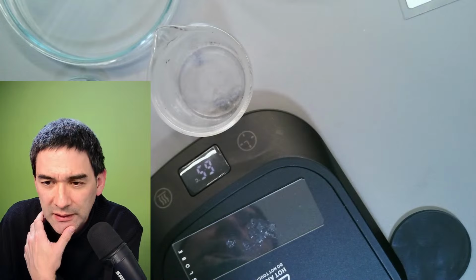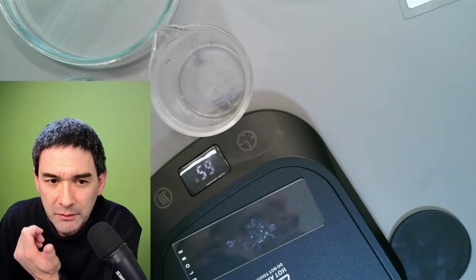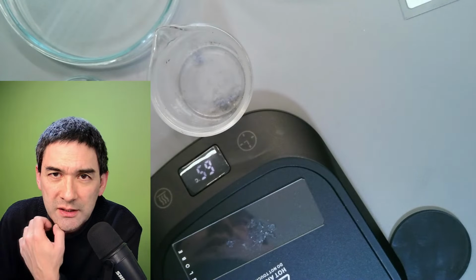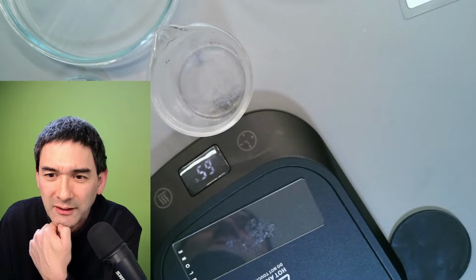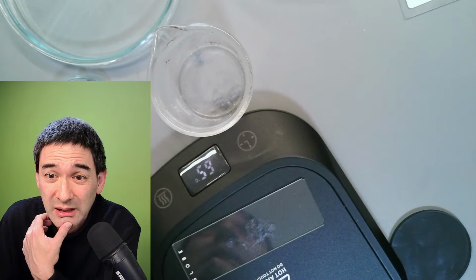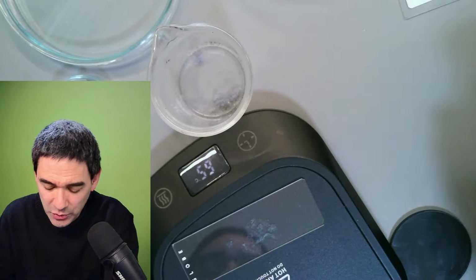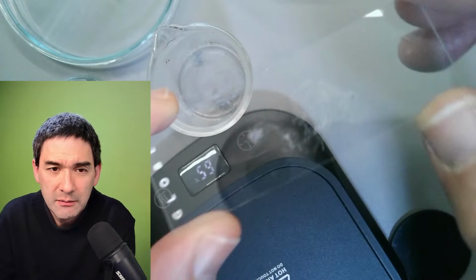I know that asbestos under the microscope does have a specific look. But honestly, you'd have to scratch stuff off from the garage roof, or you'd have to cut it, and you probably don't want to do that, because it's the asbestos dust which you don't want to inhale. So okay, now it's dry again.